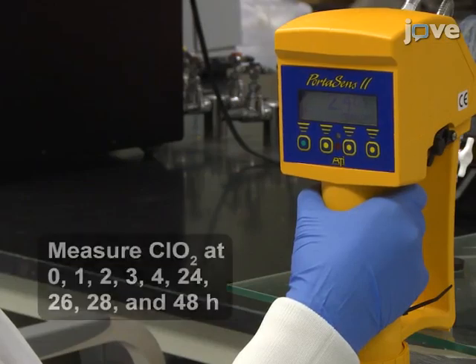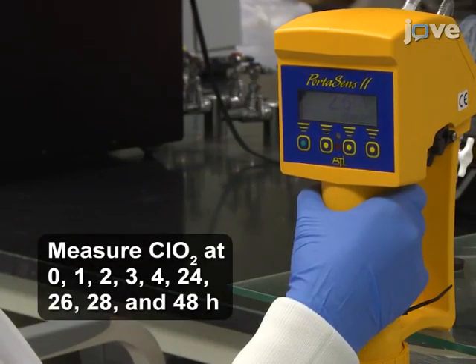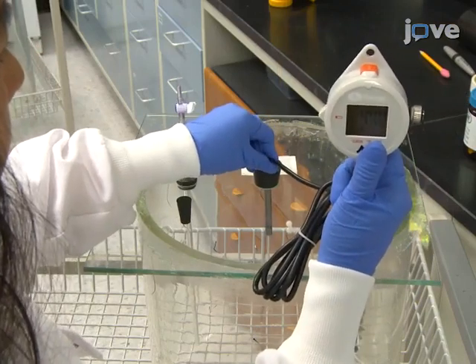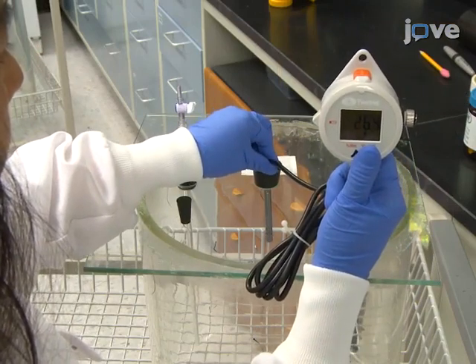Then, measure the chlorine dioxide concentration in the chamber at the indicated time points and monitor the temperature and relative humidity with temperature and relative humidity data loggers.